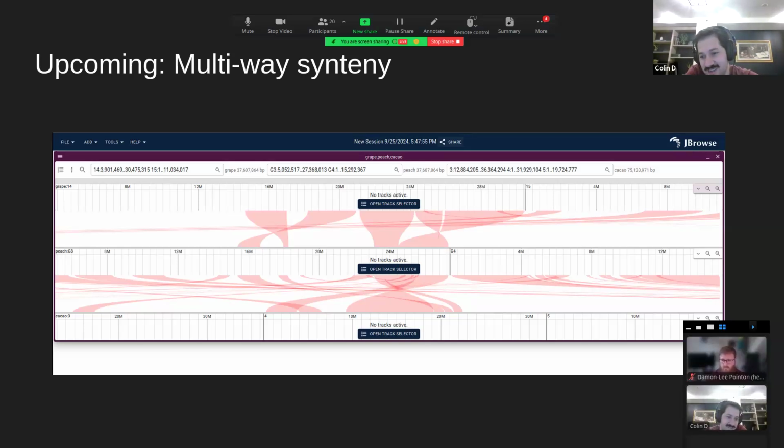A similar thing can be done with long reads. You filter it for reads that are split. And so that is what I do: I filter all reads that have the SA tag. So that's the split alignment tag, or supplementary alignment tag, SA. A lot of people won't do that because it just takes effort to make another BAM file. It's like, why can't I work with my existing one?